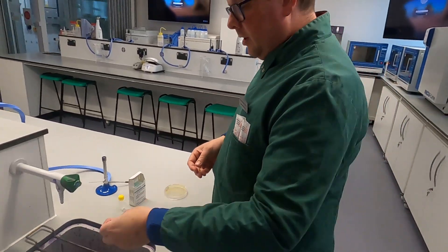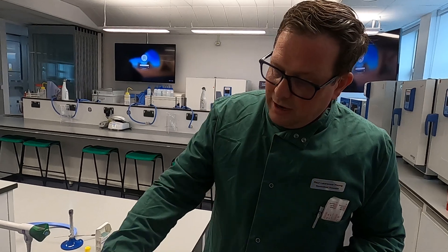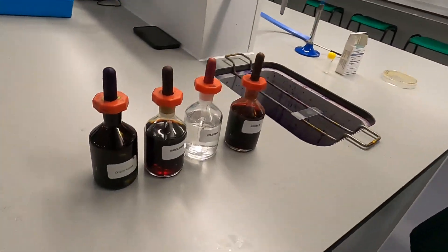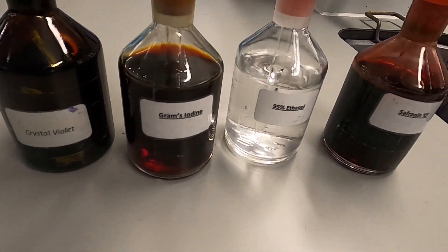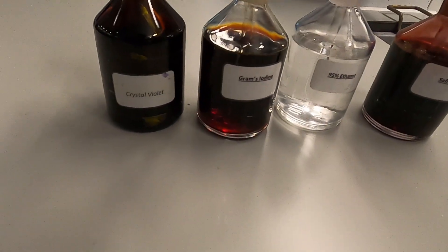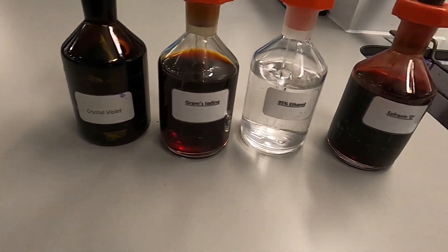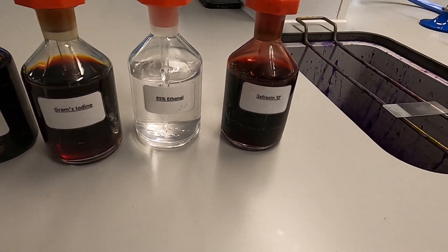For the next step you actually undertake the gram stain itself, and for that you have these four reagents. I always line them up in the order I'm going to use them so I don't have to think about it. On the far left you have crystal violet, followed by Gram's iodine, 95% ethanol, and safranin O.